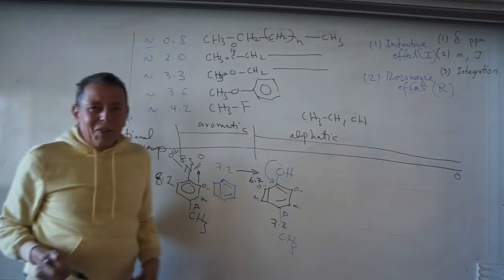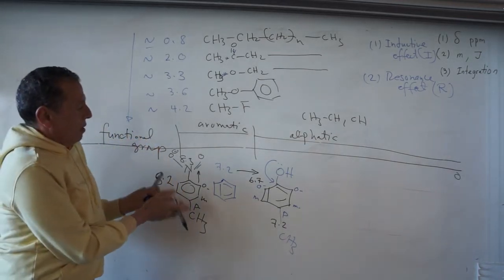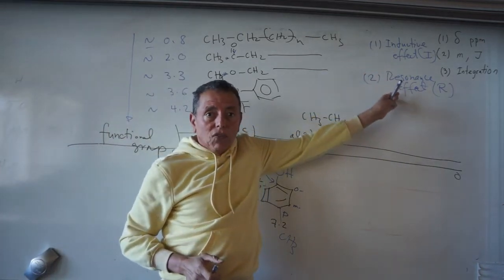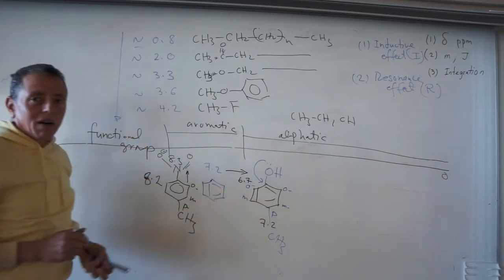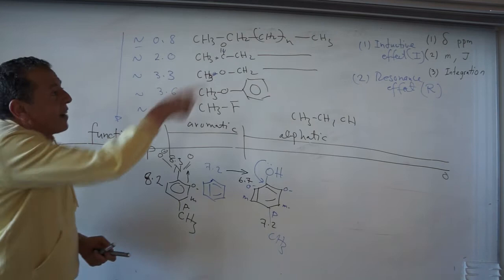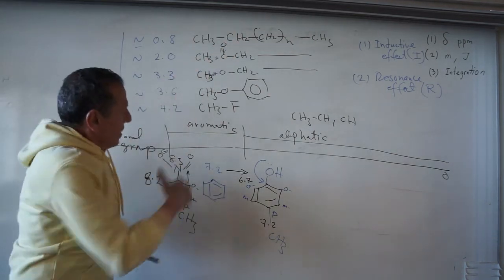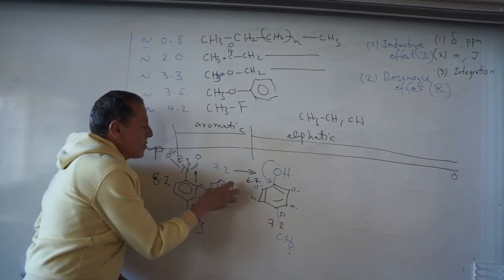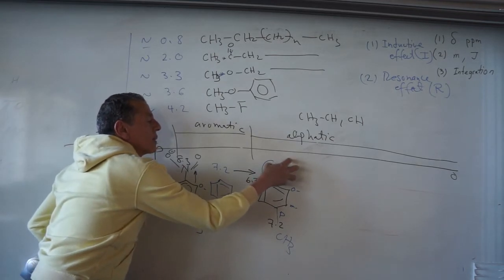So I think now you agree with me that you will love the NMR, because the rules of physical organic chemistry, the inductive effect and the resonance effect, are consistent with what you see in the NMR, right? So these are the strongest effects on the chemical shift. In another way, this is the reference, which is 7.2, and this is the factor affecting the chemical shift.